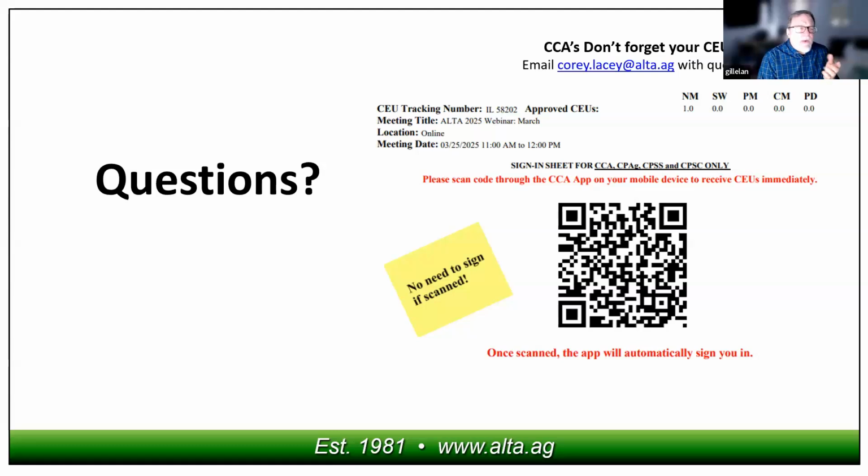Well, I guess that would depend on what your purpose is. If you're trying to see what will leach out naturally, then I would leave it as close to natural as possible. If you're looking for as close to a whole rock digest, a total digest, in some cases people actually want to dissolve the silica. So if you're going to throw HF in there, I would take it down to a very, very fine powder, because you're optimizing surface area to get as much into solution as possible. So it comes down to what your purpose is.